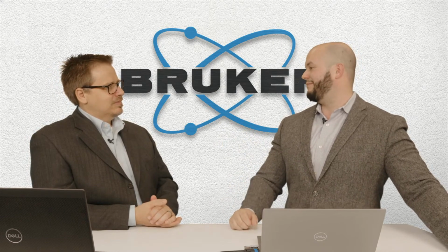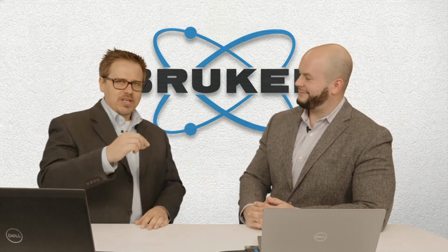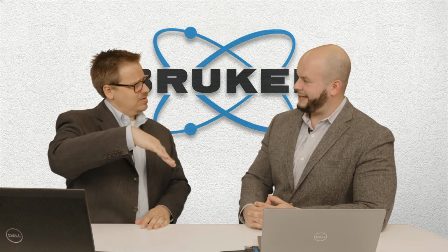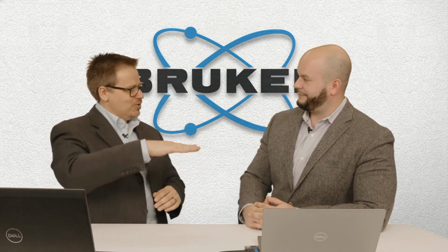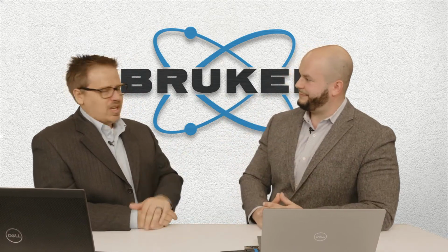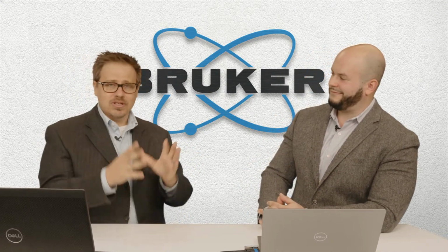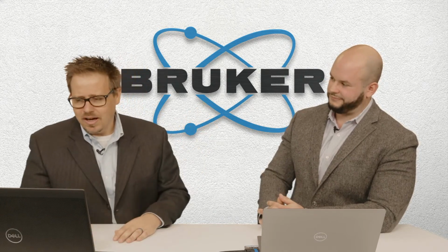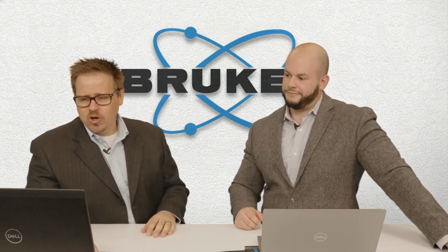And you need a spot beam. Yeah. So I would say the recommended or normal way of doing this is going to be a spot beam and a stage that can tilt. Like we call it a cradle. So it tilts, rotates. Right. There are ways that you can do texture analysis without that. You can do it just with rotation, and then iso-inclination, where you're kind of rocking the arms, and even a line beam you can use in some way. But for 95, 98% of people, you want that cradle, as it's called. There are smaller cradles for smaller machines, bigger ones for bigger machines, and then a spot beam. Yeah, a point beam.